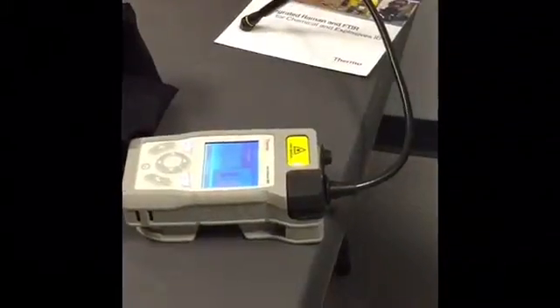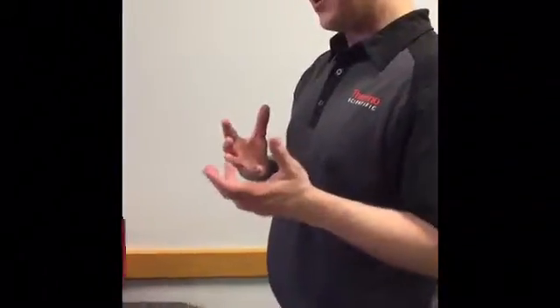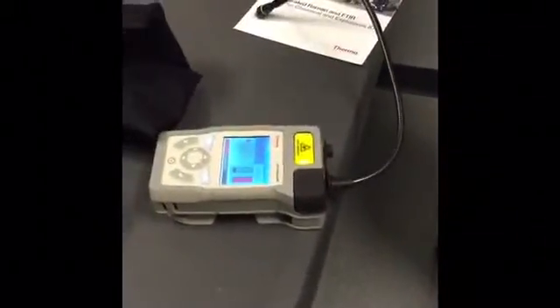There are three options for charging. You can use AC power, there's a rechargeable battery that comes with it that you can charge in the device or a separate charger that gives you up to four hours. You can also use Surefire 123s — put the three disposable Surefires in there and get up to five hours on a charge. You have a lot of charging options; you should be able to go all day.